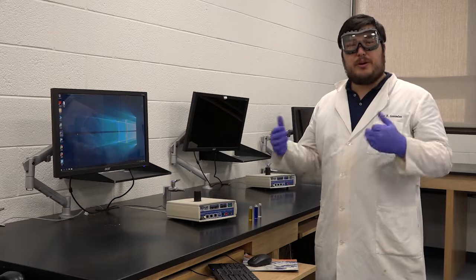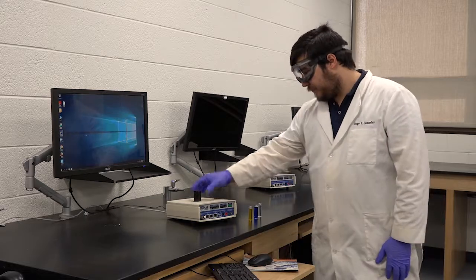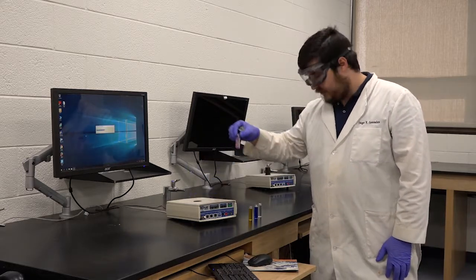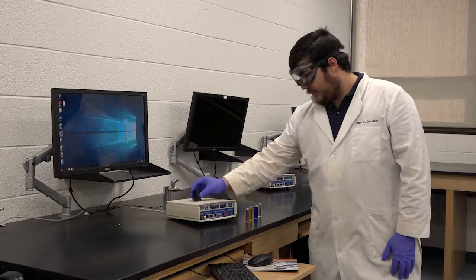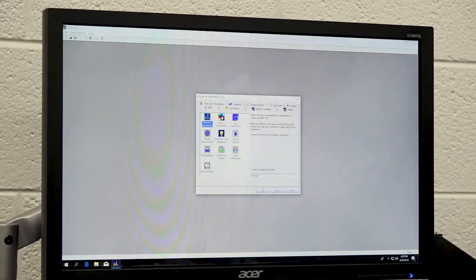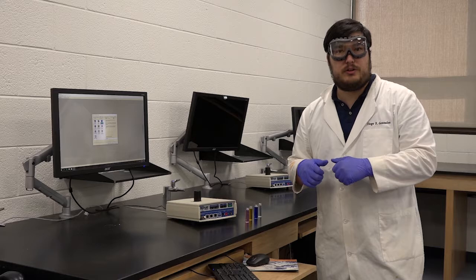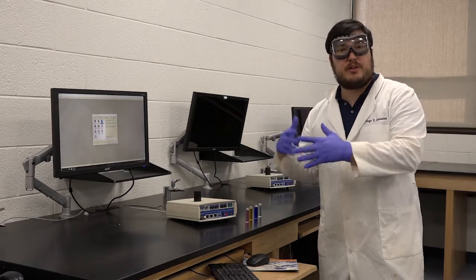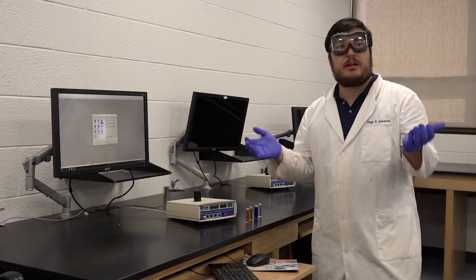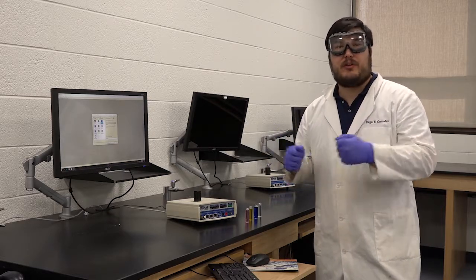So now we're going to restart the microlab program and reblank our DI sample. I'm going to take out the potassium permanganate sample that we had in there, and we're going to allow the machine to start up and initialize. This time, instead of spectrophotometer, we're going to go over to color comparison. This application in the program is going to allow us to mix the colors without actually physically mixing them. It's going to take some of the information in the software and theoretically combine the absorbances and the transmittance to provide us with the color mixing without physically doing it.